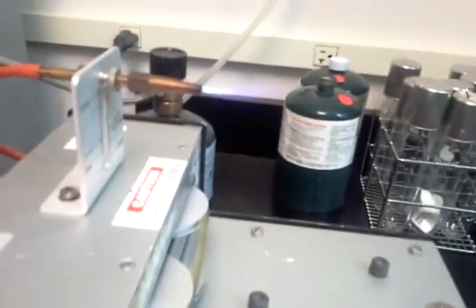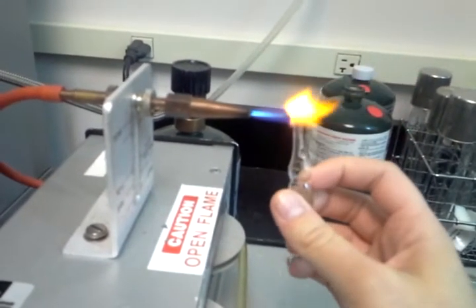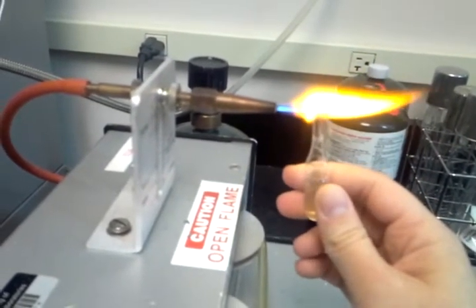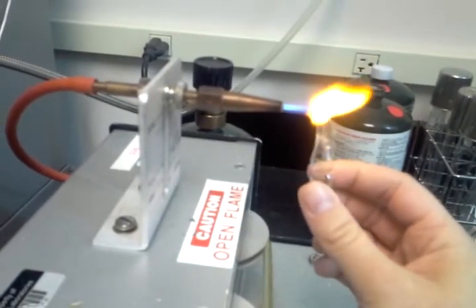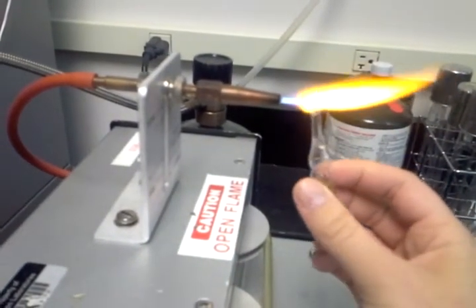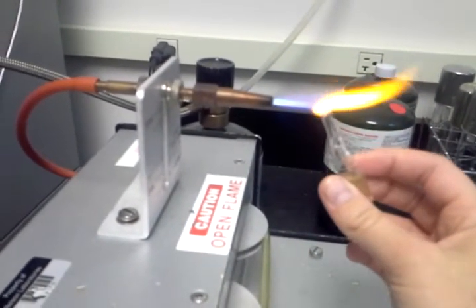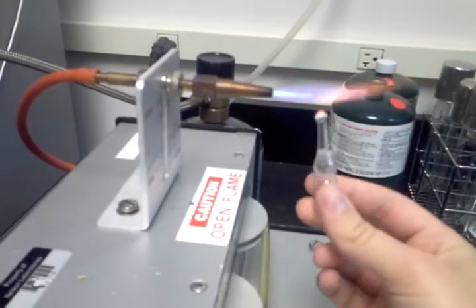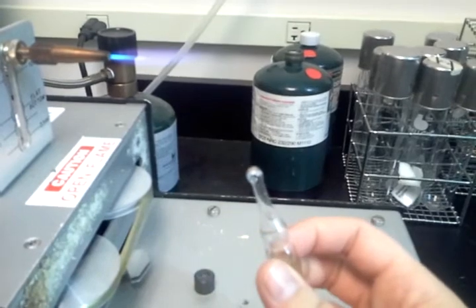I'll do one more just to show you guys. You can see that it's starting to swell at the top there, which means I have to be careful — if it swells too much it won't be sealed anymore.